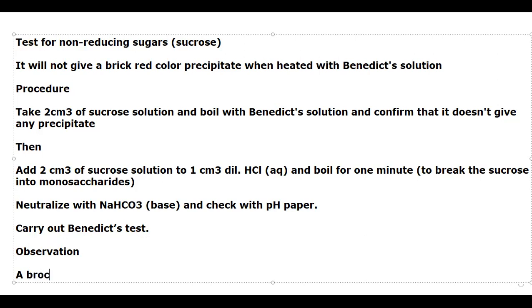So a brick red color precipitate would be obtained. Previously it didn't give the precipitate, that we confirmed already. Now it is giving a precipitate that confirms it is a non-reducing sugar. Or you can call it is sucrose. Clear?